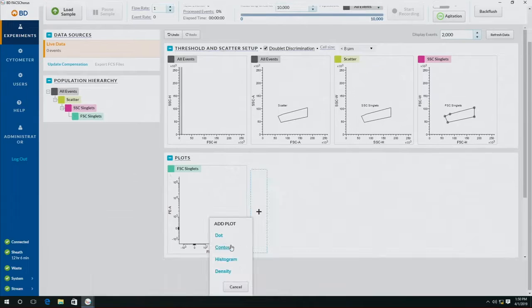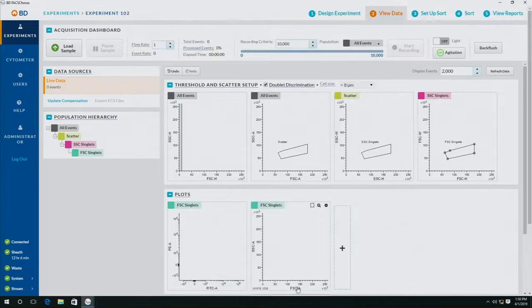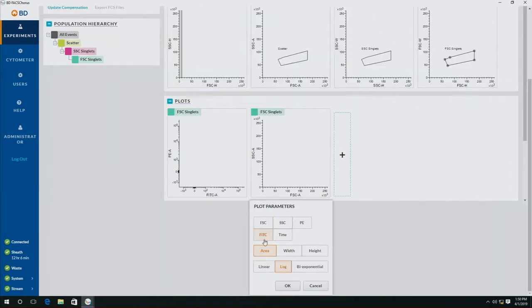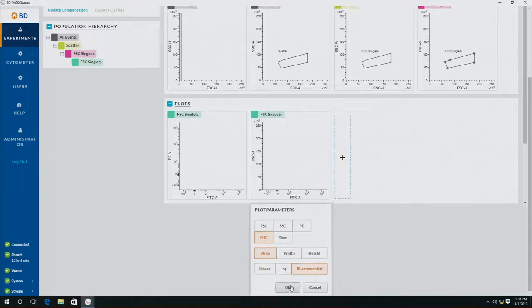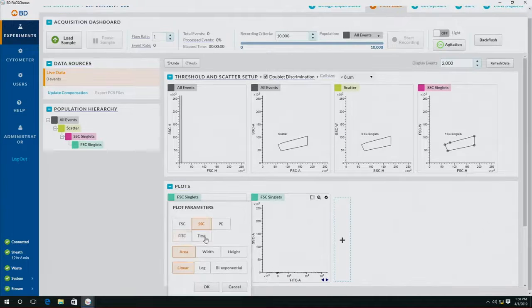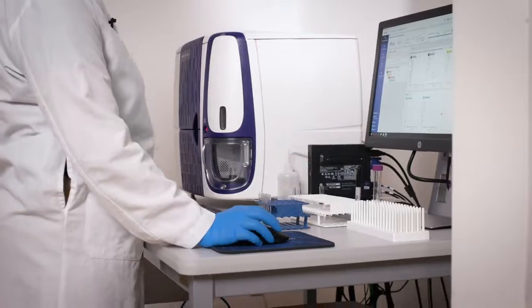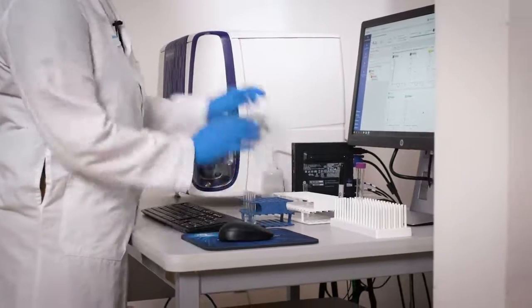I'm now ready to load my sample, so I'm going to select my sample, put it on, and then click load sample.